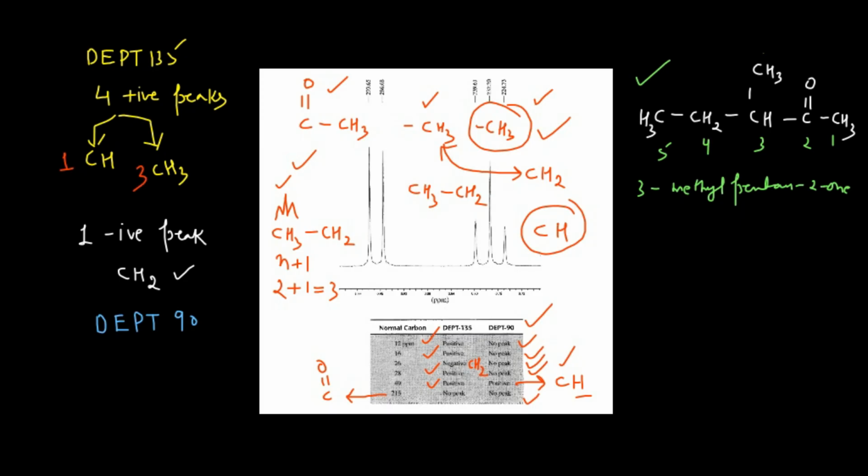Okay, so first of all we need to check the splitting pattern. See, this will give you the singlet. S, I am writing here. Okay, and say this one, this will give you what? A triplet. And then you are having this. See this, why is this producing a singlet? Because there are no hydrogens present on the neighboring carbon. And why is it giving a triplet? As I explained here, because in the neighbor you are having two hydrogens.